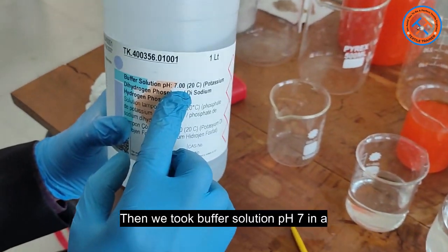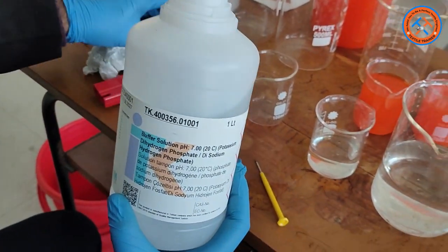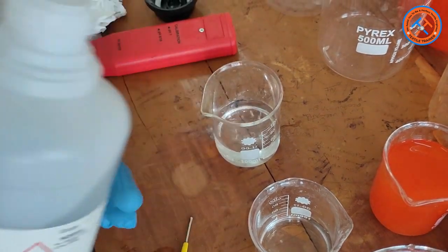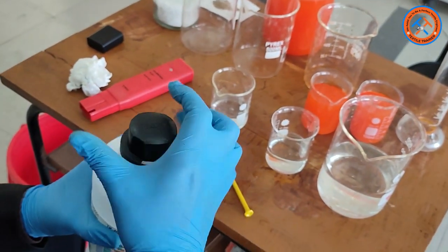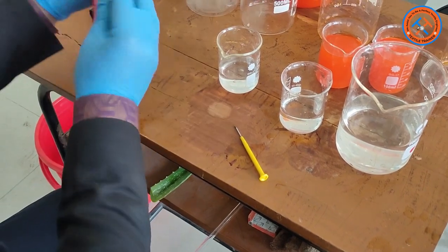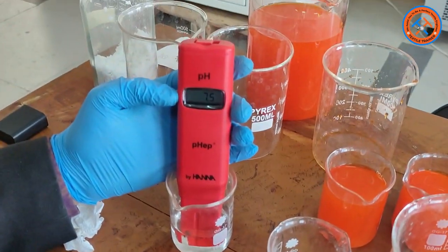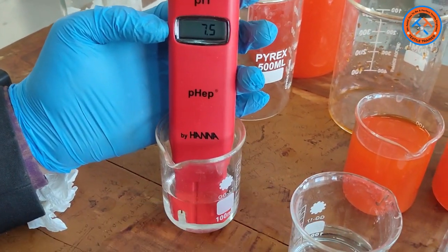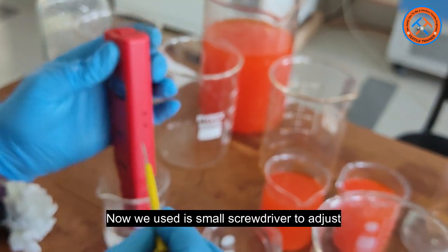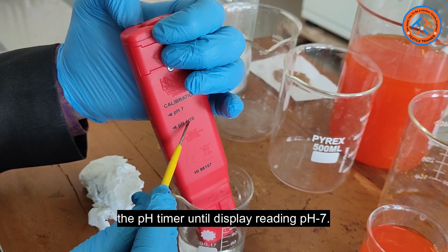Then we took buffer solution pH 7 in a beaker. Dip the tip of the electrode in the buffer solution. We will wait until the reading stabilizes. Now we use a small screwdriver to adjust the pH trimmer until the display reading shows pH 7.